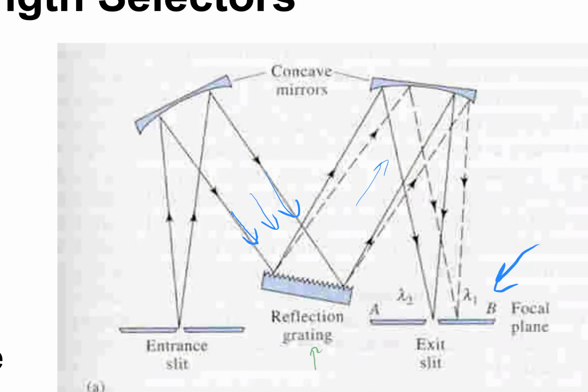So the light which diffracts off the grating is collected by a concave mirror and then focused down. Sometimes this is called a focusing mirror. Okay, let's focus down again at this plane, this focal plane, where I'm going to place an exit slit as well. But the light which is diffracted off the grating, remember it was spreading out, and it's got to appear its constructive interference at a particular point. Well, each wavelength, after focusing, will produce bright spots down here on this focal plane. So maybe the blue light appears right there. Okay.